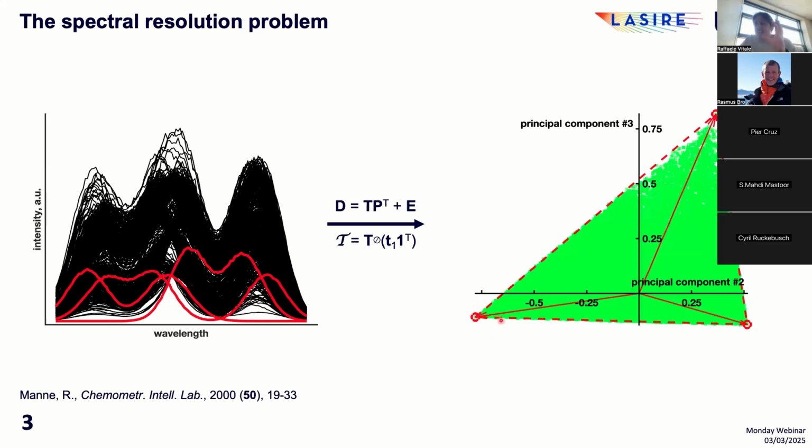archetypes. Generally speaking, archetypes correspond to the most linearly dissimilar observations of a multivariate dataset, support its multidimensional convex hull, and share an essential mathematical property. All the other objects of the dataset indeed can be expressed as convex linear combinations of archetypes measurement vectors. Now, based on what we have said up until now, it is pretty clear that in this specific case, finding archetypes would readily translate into spectrally unmixing the investigated data.